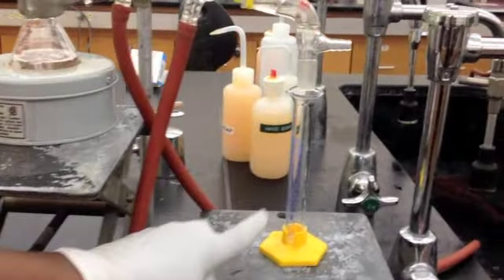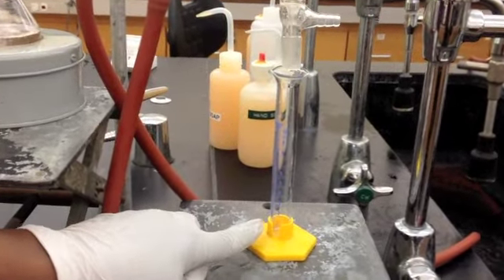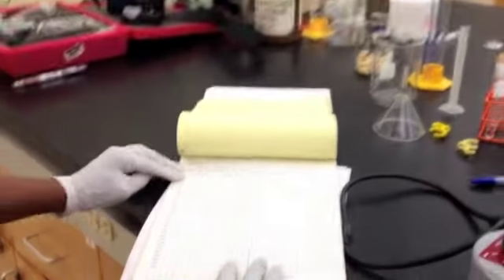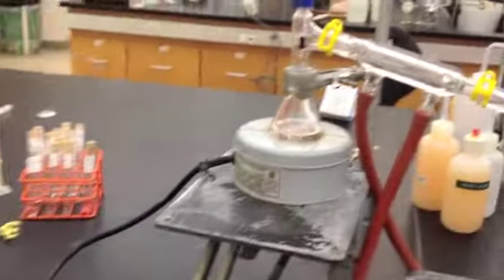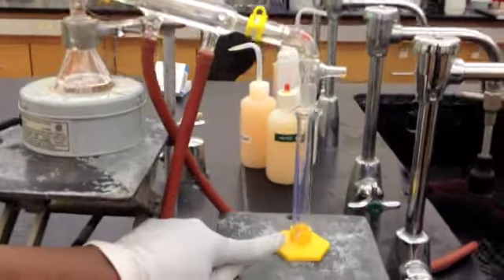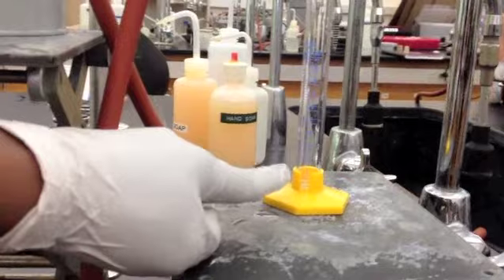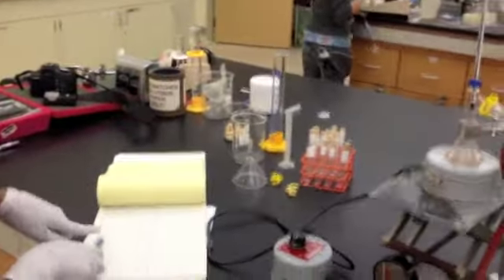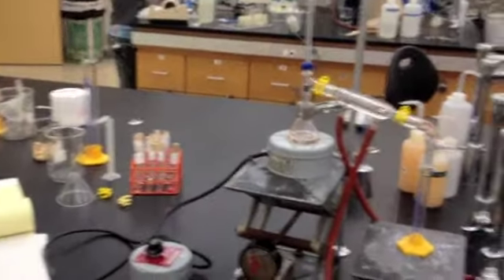You can see it's starting to collect. We're going to wait for it to get to the 1 milliliter mark, and we'll record in our notebook 1 milliliter and that temperature. You have to pay close attention to your 10 milliliter graduated cylinder for the volume measurement. As soon as it reaches the 1 milliliter mark, you look at your temperature and record it, and you'll keep doing that for successive volumes until it's done.